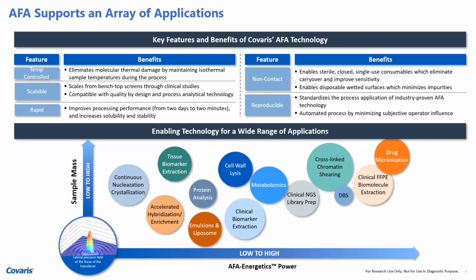So over the years, as I have been saying, we have seen this technology being used extensively across different kinds of applications, whether you take metabolomics, proteomics, biotherapeutics, which is biopharma, so to speak. I started with those because those are my favorite topics.